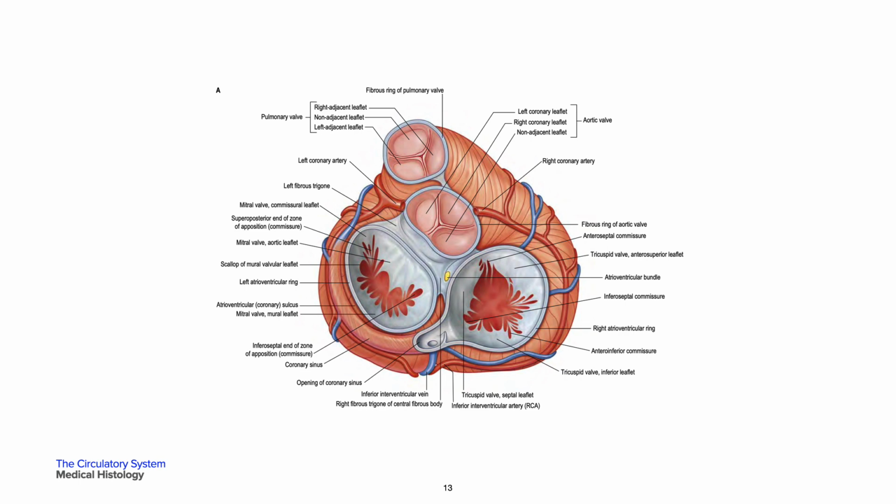The ventricularis is the most elastic fiber-rich layer, with multiple layers of elastic tissue, and they line the ventricular surface of both semilunar and atrioventricular valves, and also coat the tendinous cords.